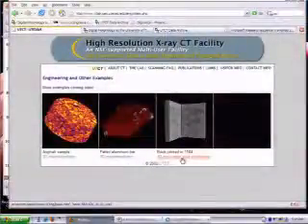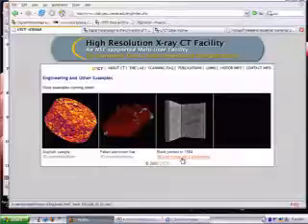These are asphalt cores. Asphalt is a big business, a remarkably big business. Everybody wants smart asphalt that lasts and has the right amount of permeability and does all these things that make our roads better. And it turns out that's big science. When they make an asphalt core, once they've done that, they have no idea what's on the inside, how the pieces fit together, and so forth. So they bring this to us, and we scan a lot of asphalt cores.